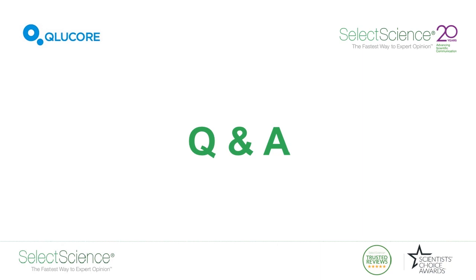It's a good question, and it's a little bit tricky to answer. Yes, you can absolutely, but I will give it an answer in several steps here. You can absolutely analyze a whole transcriptome in a single go. We have been running it with hundreds of transcriptomes in parallel.